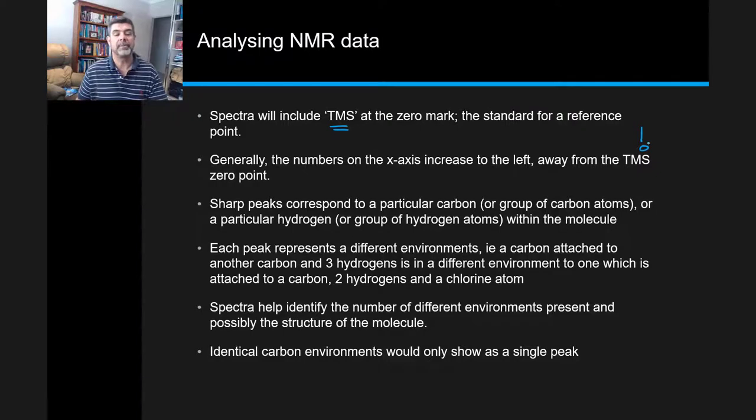Spectra also help identify some aspects of the structure of the molecule. They may not always be definitive, and we may need to use NMR in partnership with other data to make exact conclusions.